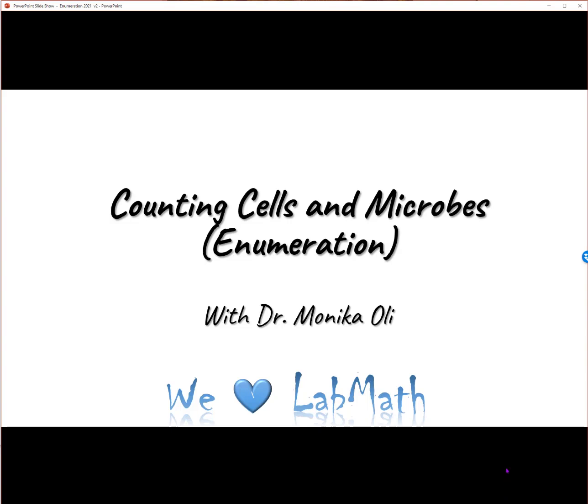So this video is about counting cells and microbes. It's about the enumeration. Counting cells and microbes is really important in many different areas, regardless of what you work on.